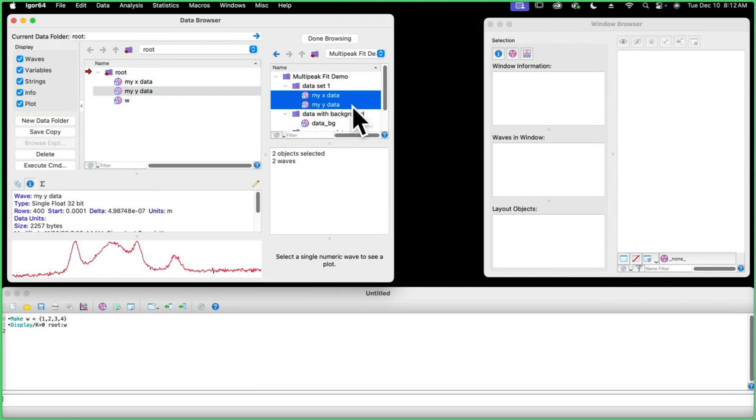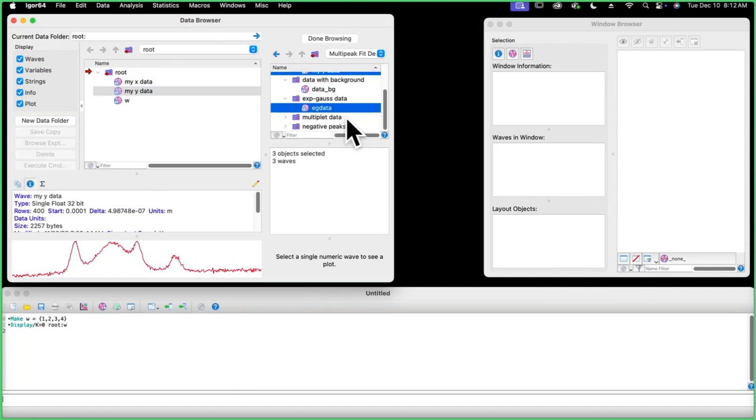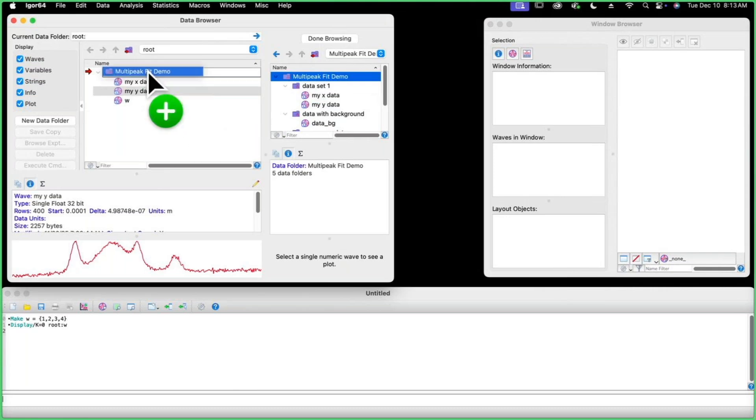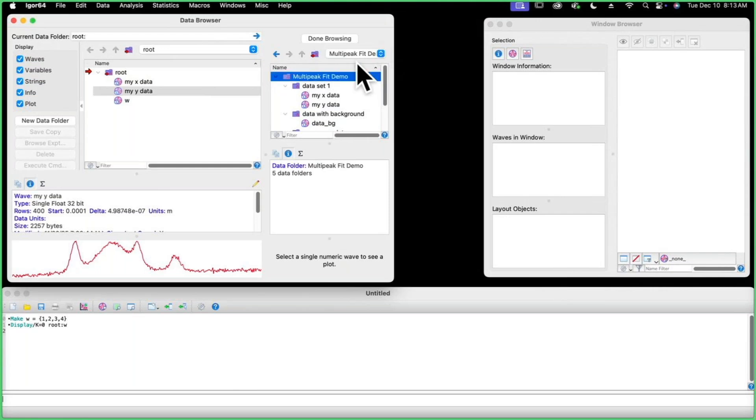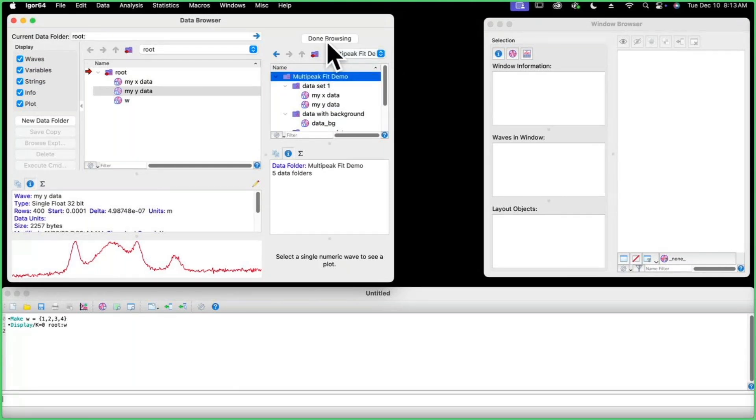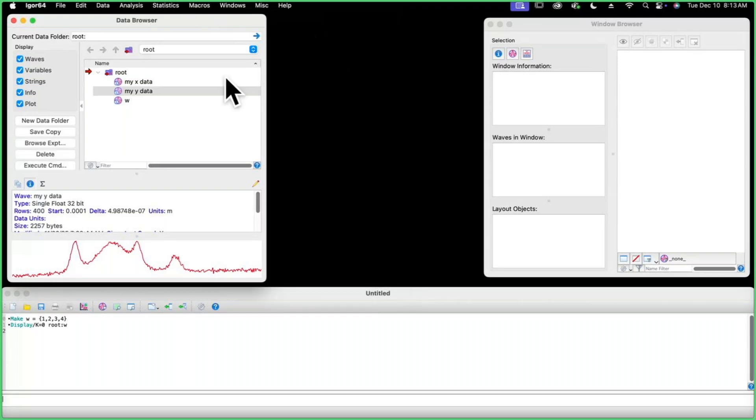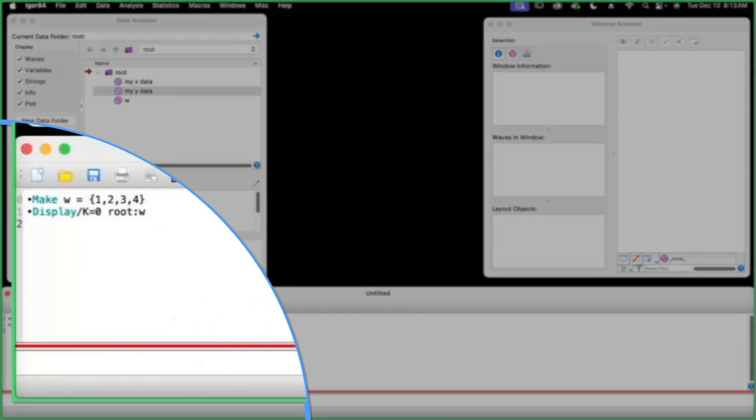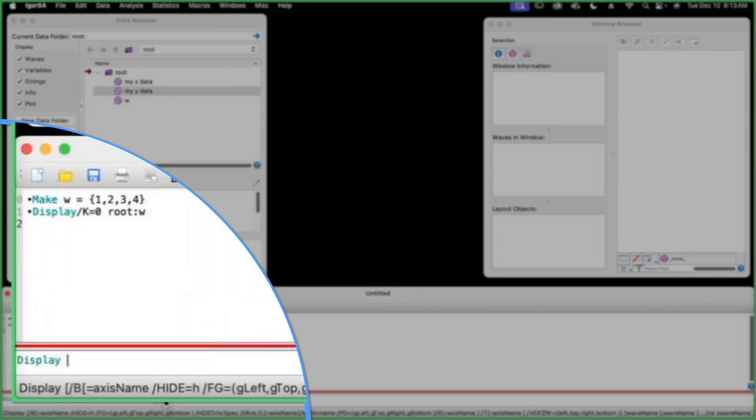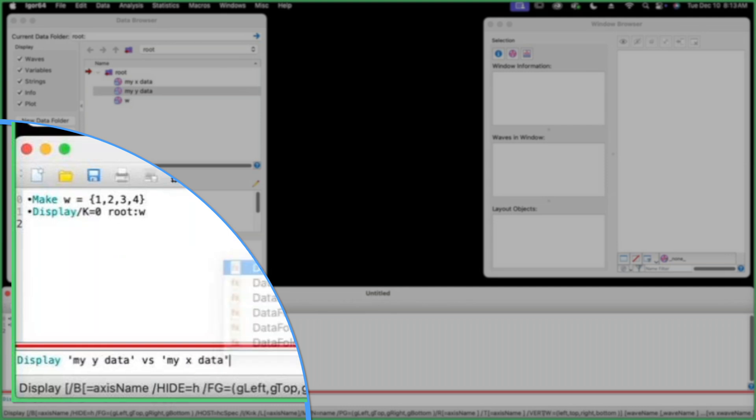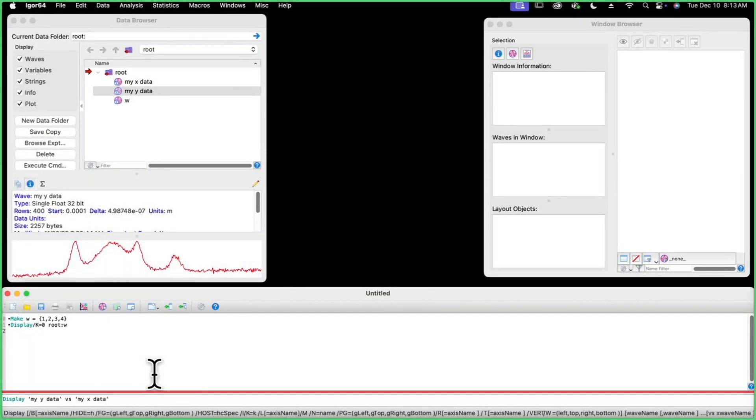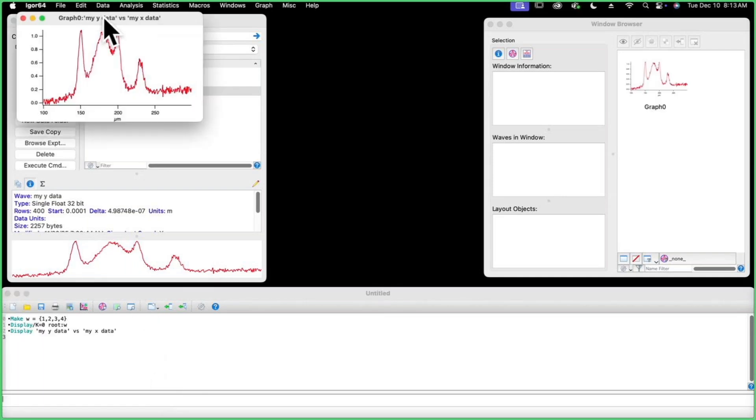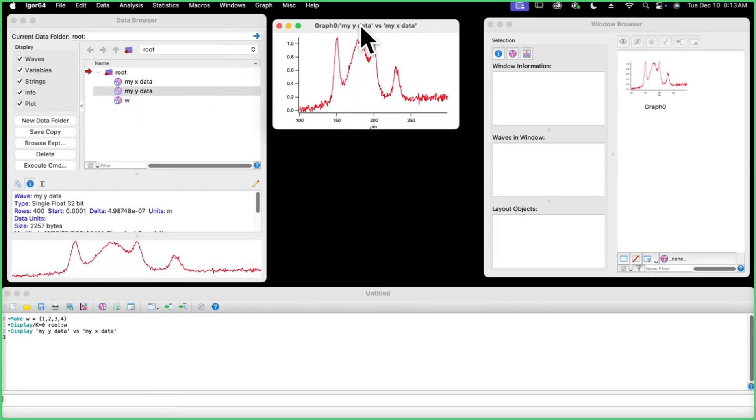You can also use the command key to highlight more elements. You can even select entire folders, even everything in the whole experiment if you wish. And you can have multiple of these open. You can select between them here, and when you're done browsing and have all of the data that you want from that experiment into your new experiment, you just hit done browsing. Now let's look at these waves in a graph. We'll display my Y data versus my X data. These wave names have spaces in them, so I've used single quotes to be able to use them on the command line. And here we are, looks pretty good. That was very simple.